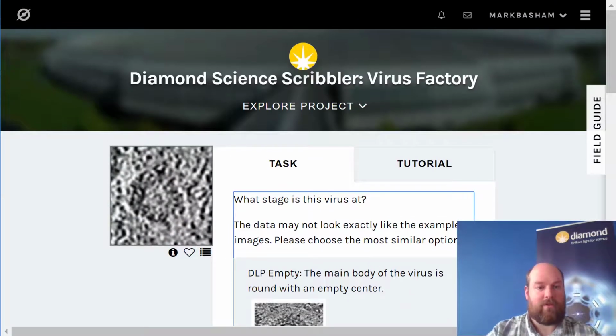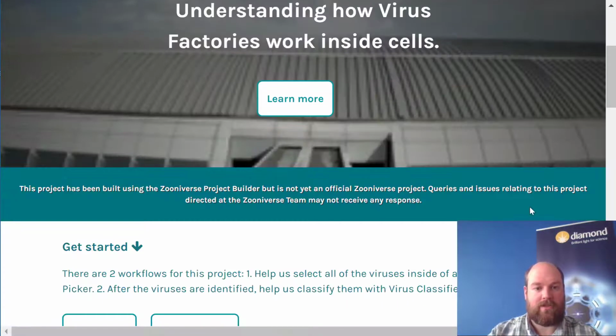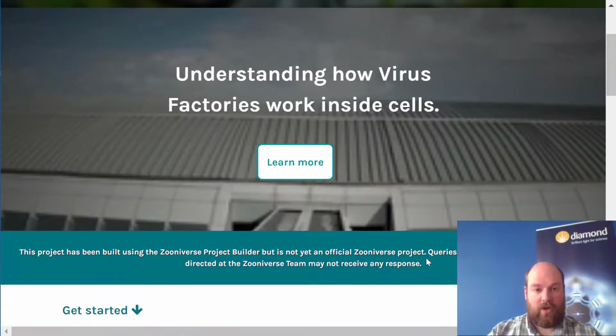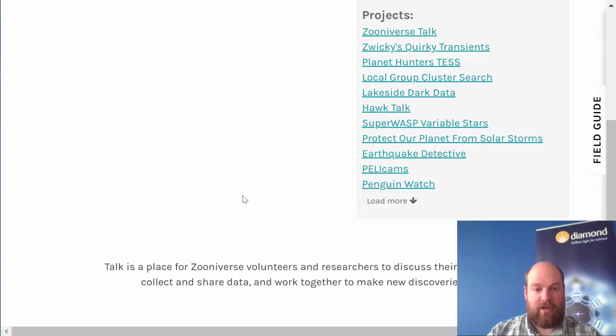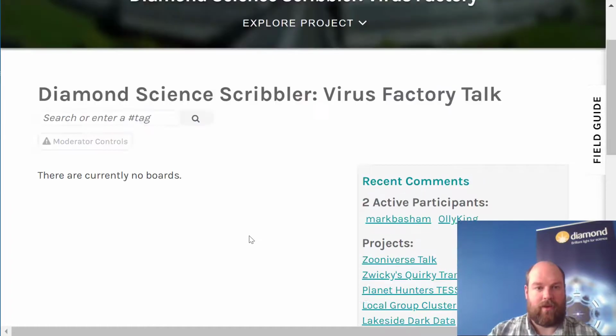Once again, you carry on for as long as you like identifying these, and essentially that information will all head its way back to us, and that will allow us to move on to the next steps of this process. If you have any questions or queries, you can always talk to us in the talk section. There's currently no boards up. That's because I'm making this before we open the project fully, but essentially there will be some boards here that you can talk about, and if you start talking about any of the specific tasks, then members from the team will come and talk to you about the specifics in terms of what we're doing.